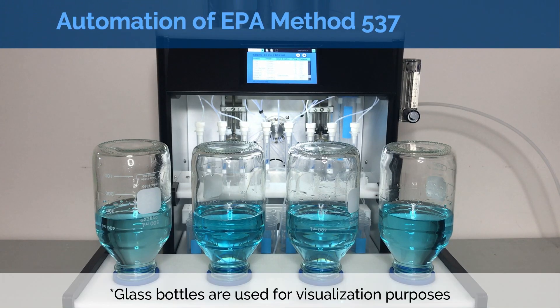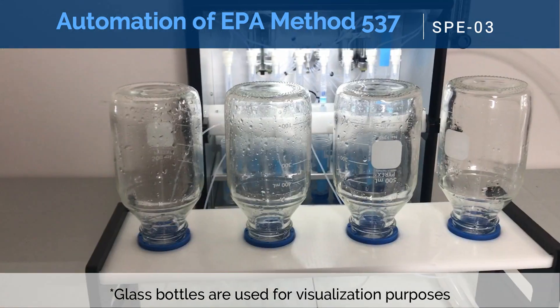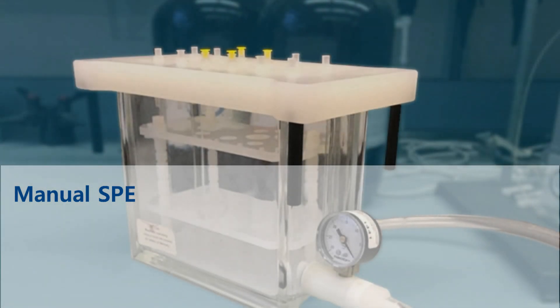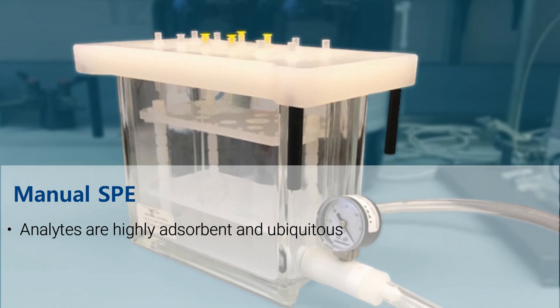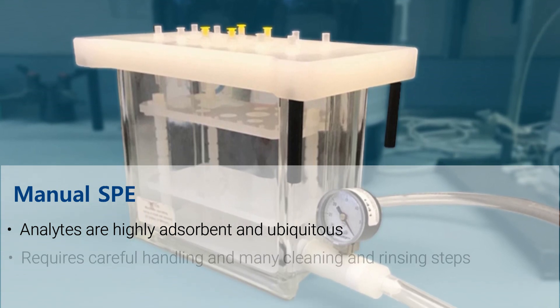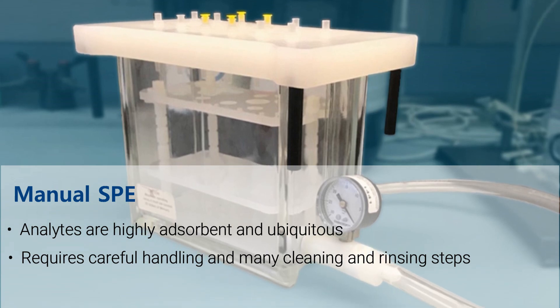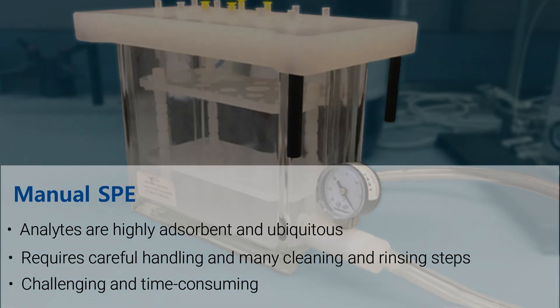Today we will demonstrate how to automate the solid phase extraction step using our SPE03 8-channel system. Many labs have been using manual SPE for this method. Due to the adsorbent and ubiquitous nature of these analytes, sample preparation has to be done very carefully and involves many cleaning and rinsing steps, making manual SPE a crucial yet challenging and time-consuming step of the analysis.